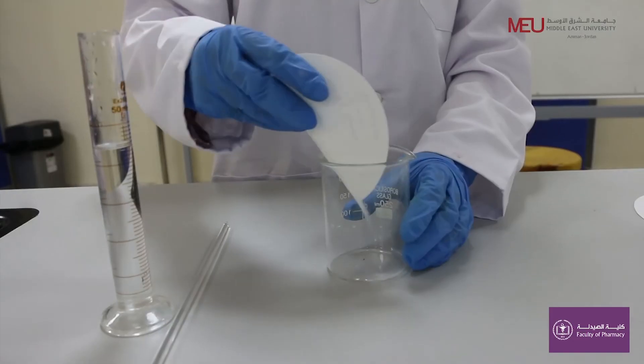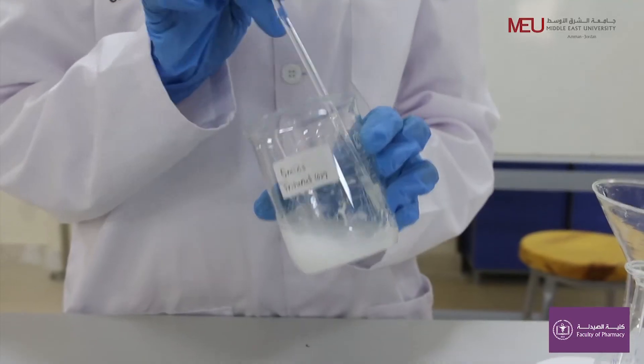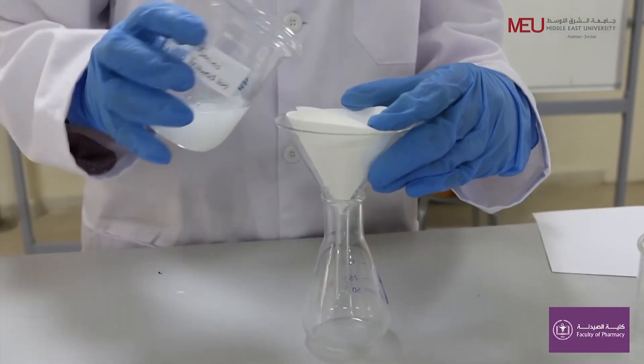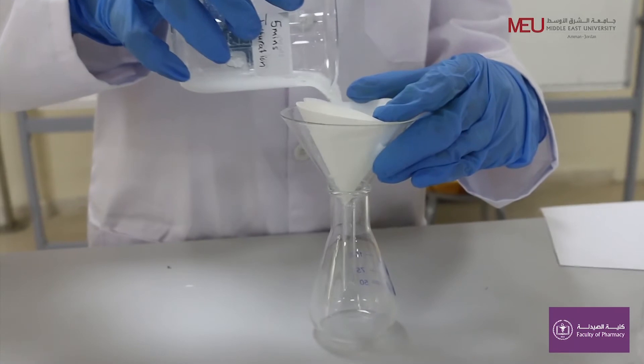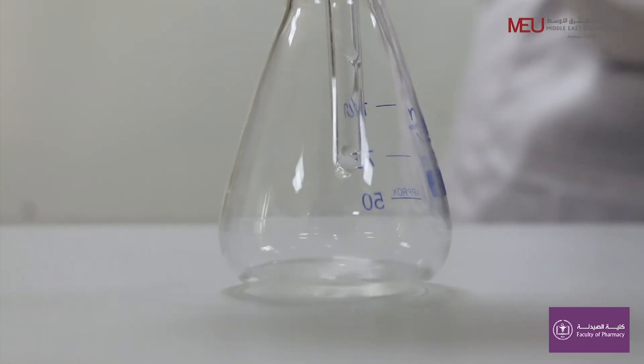Take one sample of one gram from the mixture and dissolve the sample in water. Filter the solution. The soluble powder sodium chloride will dissolve in water, and the insoluble powder talc will stay on the filter paper.